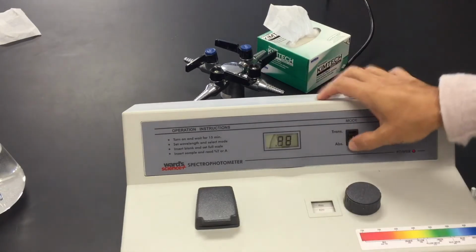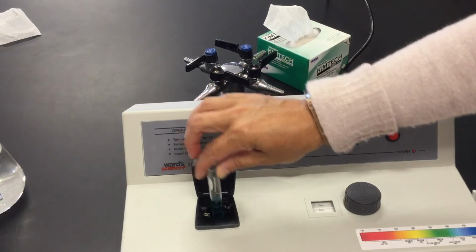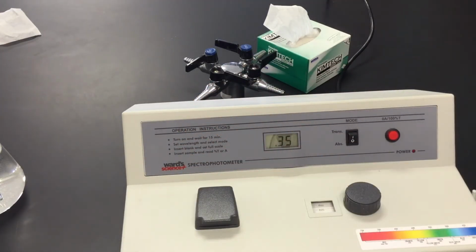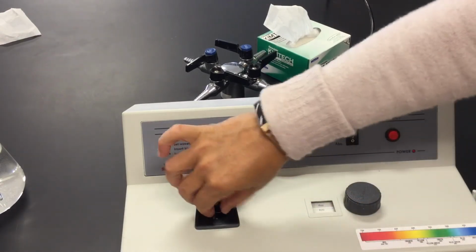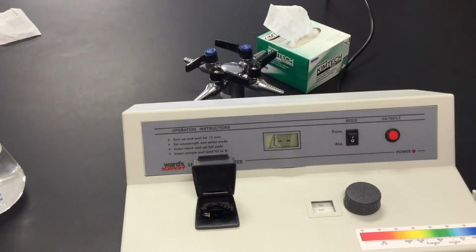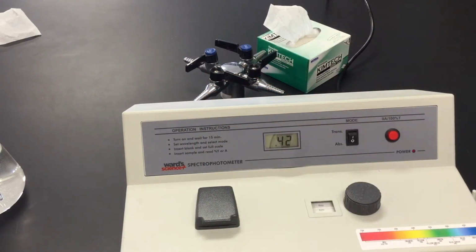Open that up, I'm going to switch back to absorption. I'm pulling out tube number 4 and putting in tube number 5. Close it up, 0.35. My transmittance, 0.44. So you're going to notice that as the absorption goes up, the transmittance should go down. I'm going to go back to absorption, open up my door, put in the next tube, close it up. This is tube number 6 now, so my absorption is 0.42. My transmittance is 37%.